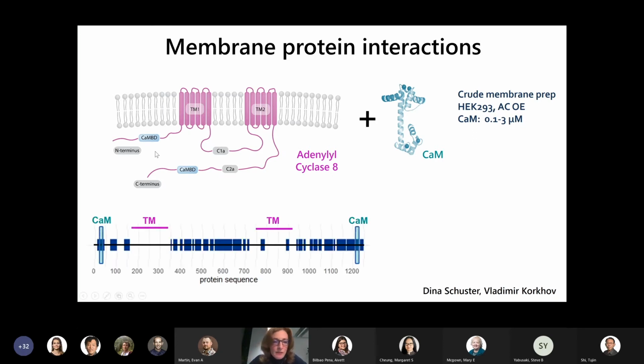We then measured peptides after the limited proteolysis and trypsin digestion steps. And here you see the coverage of adenylyl cyclase. In blue, you see peptides we measured. We did not capture the transmembrane regions, unfortunately, but that's a typical problem in proteomics. But the coverage of the protein was in general pretty good.